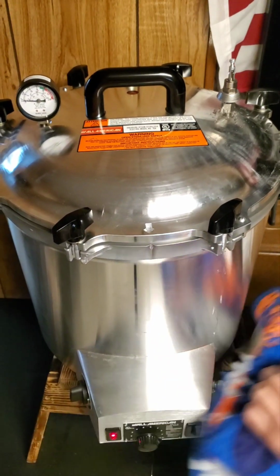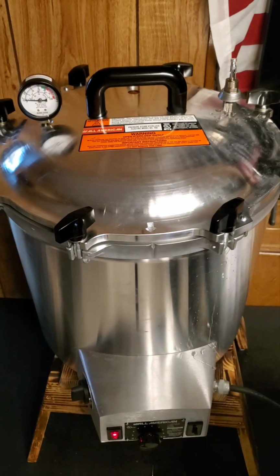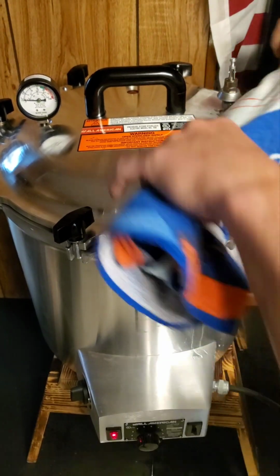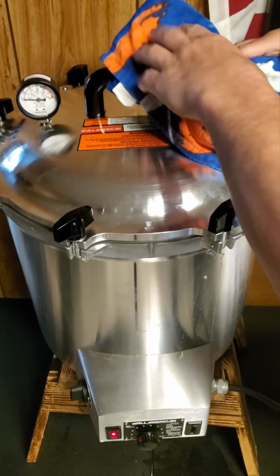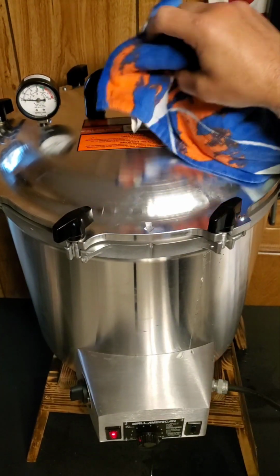I'm going to clean up this water. I want to get the bottom wet, right? I don't want it to burn to this. And you can moisten your towel if you want. But we got all this that came out. If you're really worried about your towel burning, go ahead and moisten it. But I'm going to go ahead and put it right there.